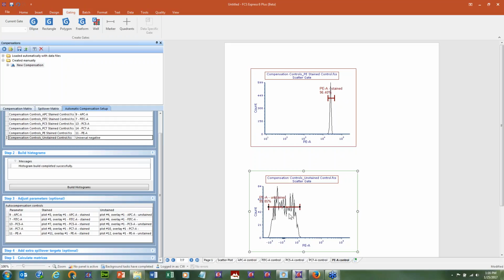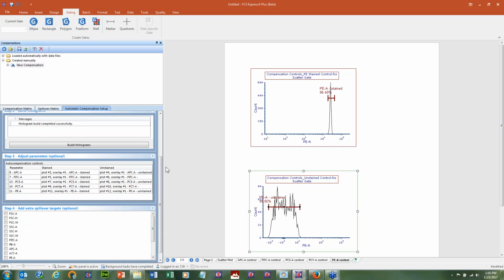Okay, I actually have an experimental layout later on that I'll open up and show you how that's done. But again, I'm skipping that for now because I just want to go through the most typical workflow with you. And again, this is another optional step here.